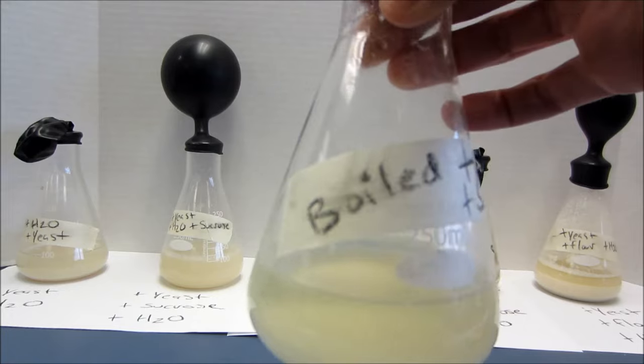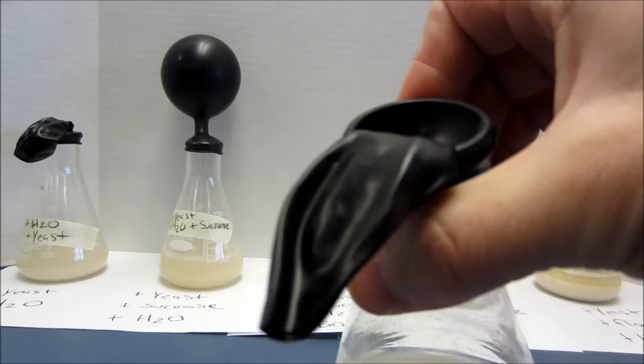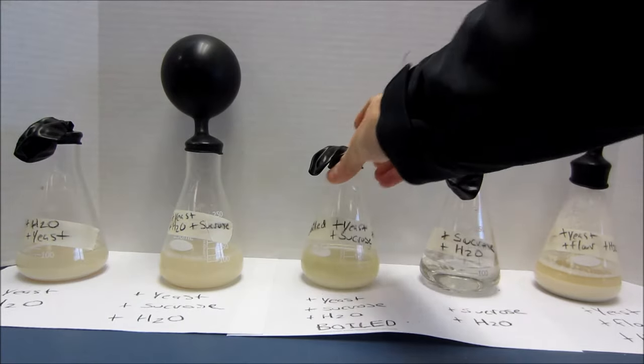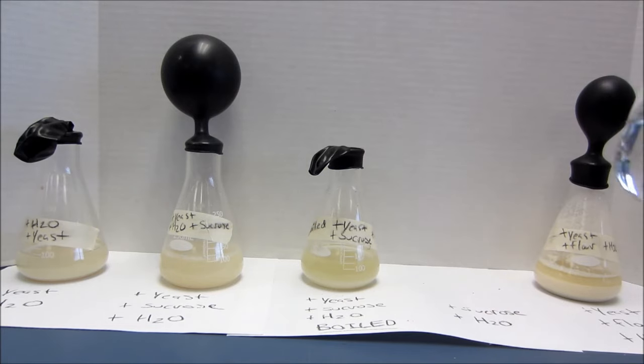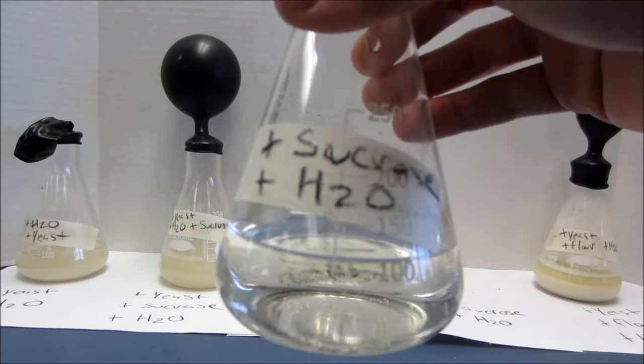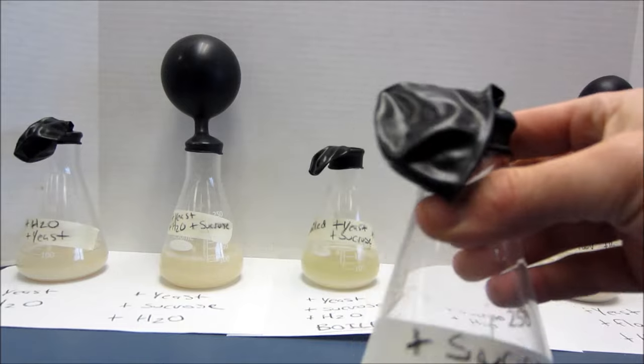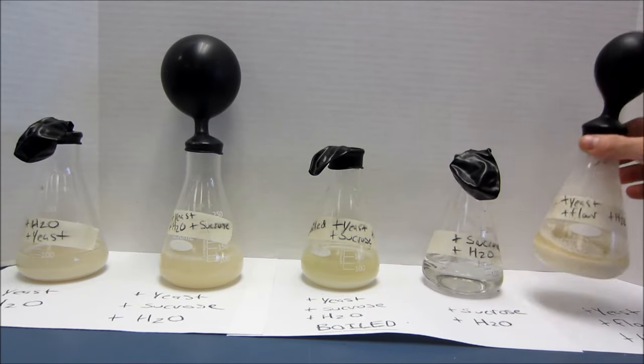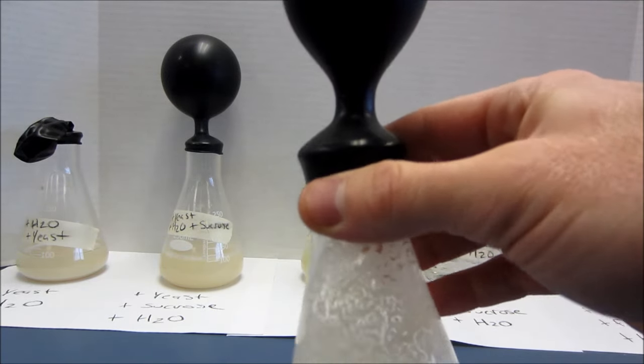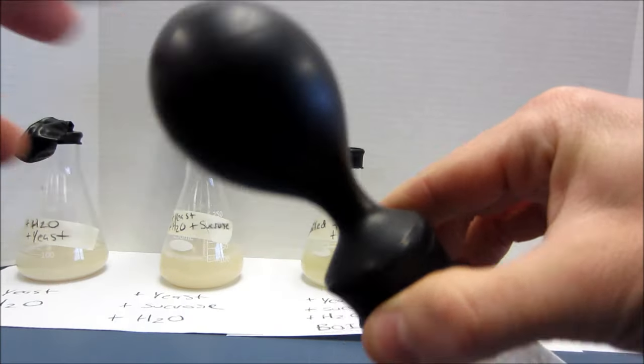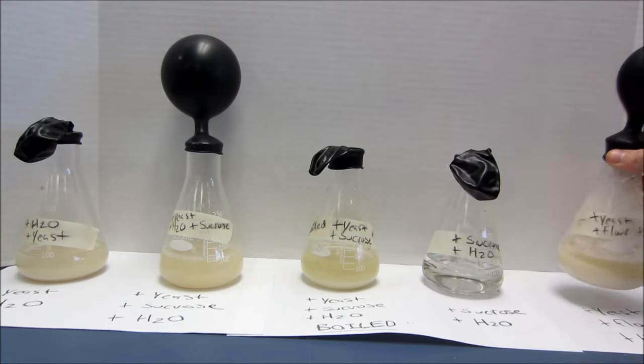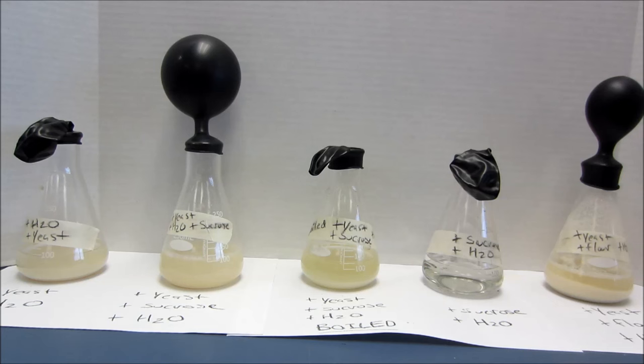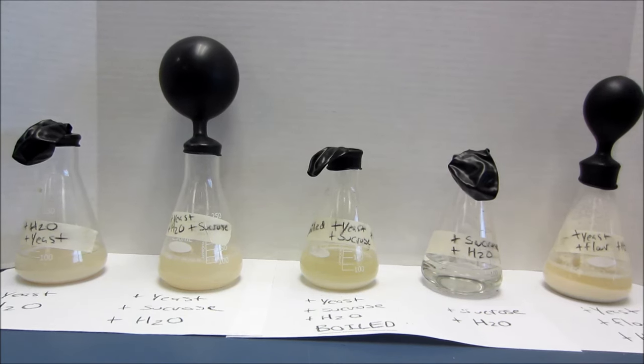The one that's been boiled has the same stuff in it, but it's been boiled. And that one failed to produce any CO2, failed to ferment. The one that doesn't have any yeast in it also failed to ferment. We see the balloon's totally limp there. That shouldn't surprise us. And the flask on the right, the yeast and the flour in the water, that one did ferment. We can see it's kind of bubbly and it's got a nice full balloon, but it's not quite as full as the other one. So here are our results.